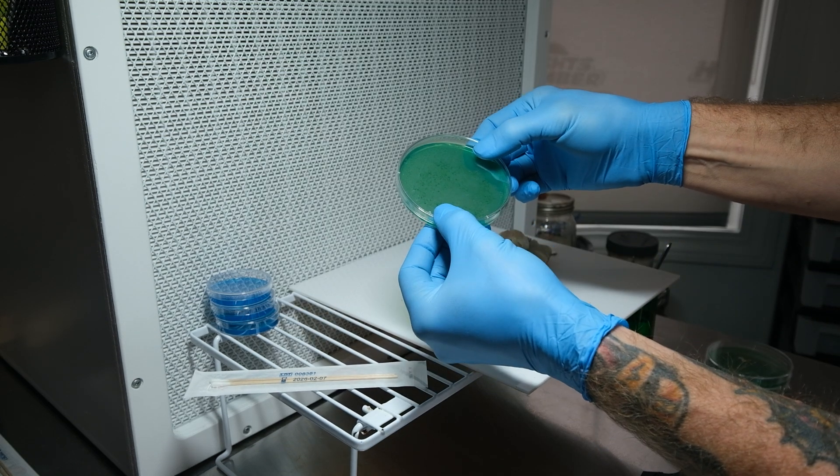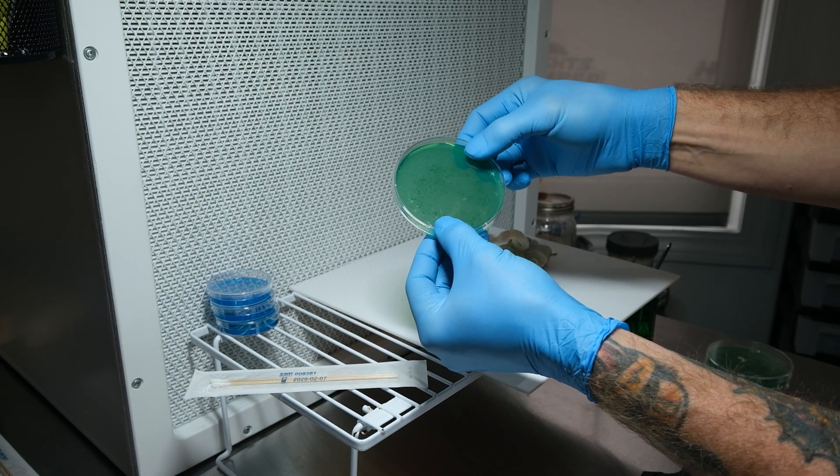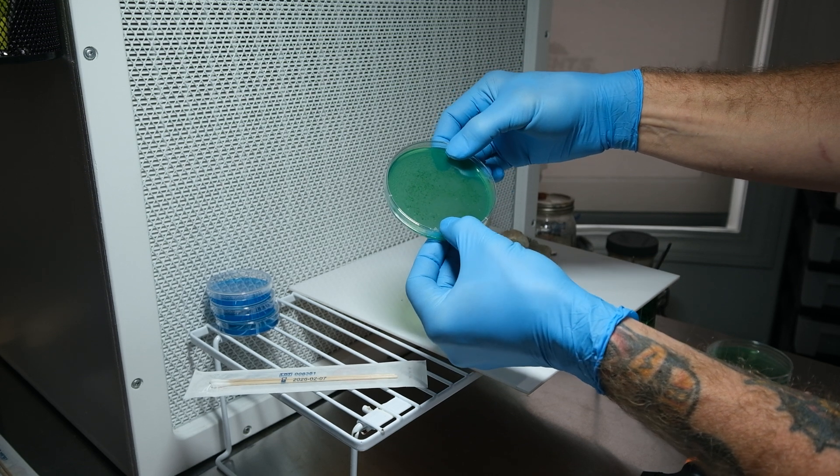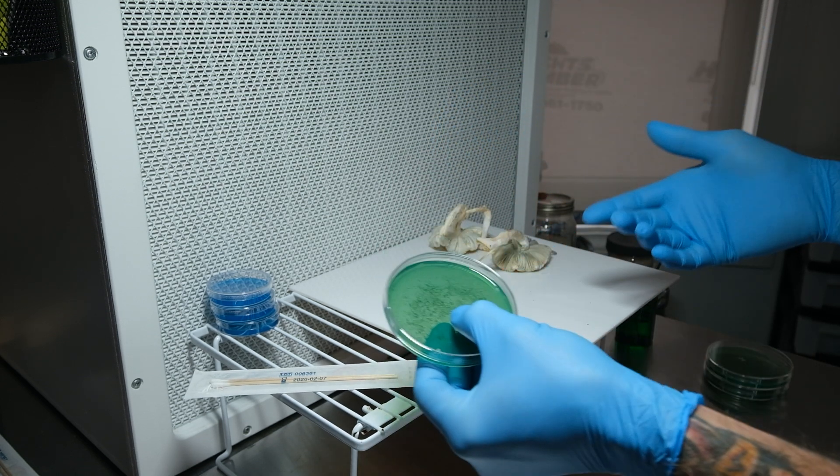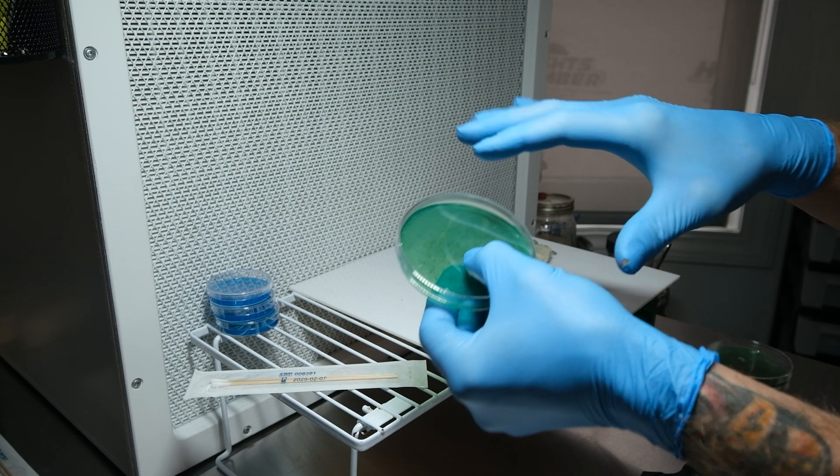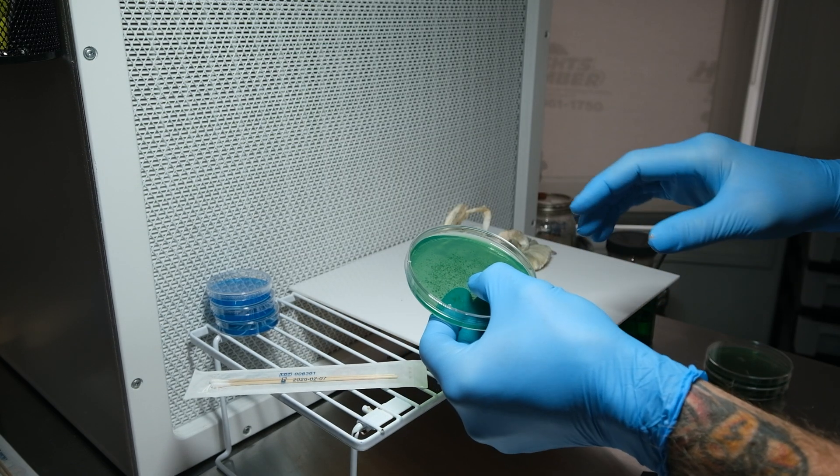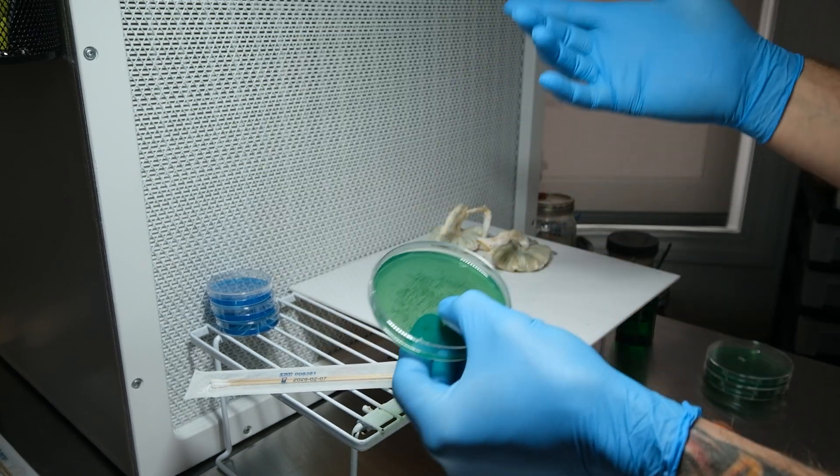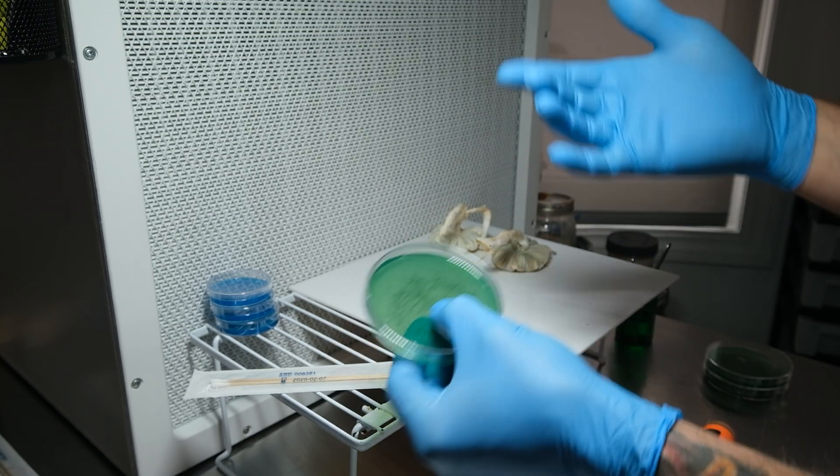And that's how you streak the plate. I don't know if you can see it in that light, but that's the way I like to do my multi-spore plates. Make sure that I get a lot of spores over a lot of area and then you'll see the pairs germinate.